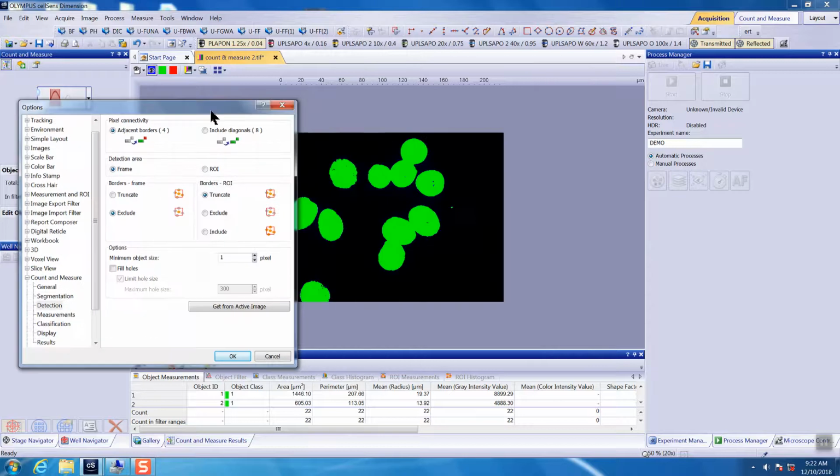But if you drag around here, you can see these small bits here are clearly not a cell nucleus, just debris, and you want to get rid of that. So you can set the value to a certain value, for example, 150, to get rid of this small unwanted signal in that region or in any region. As long as it's small, below 150 pixels, it won't be picked up. This number you plug in has to be tailored for your image. You have to try it out.